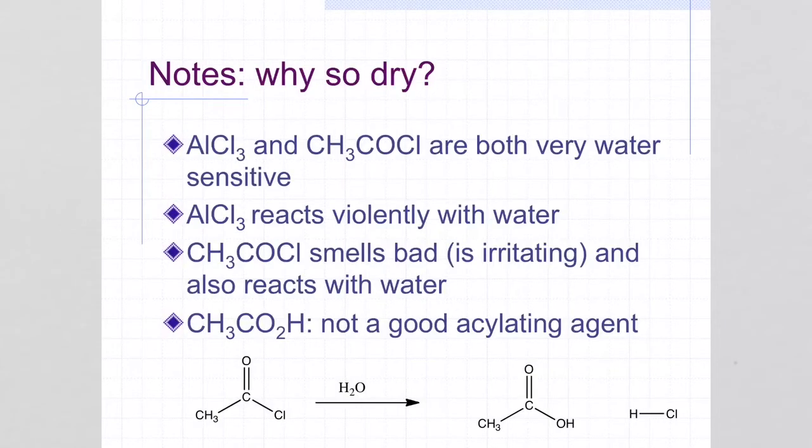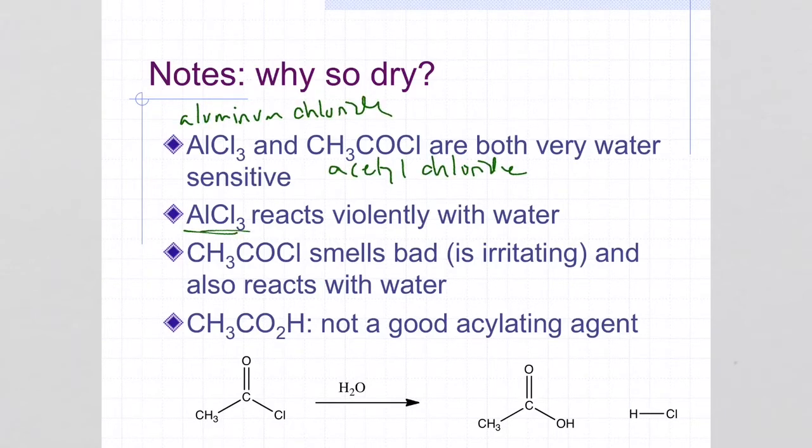So why does this have to be so dry? Well, both the aluminum chloride and the acetyl chloride are very water sensitive. Aluminum chloride reacts very violently with water, and so you need to be very careful with it as you're using it. The acetyl chloride, it smells bad, and it also reacts with water.